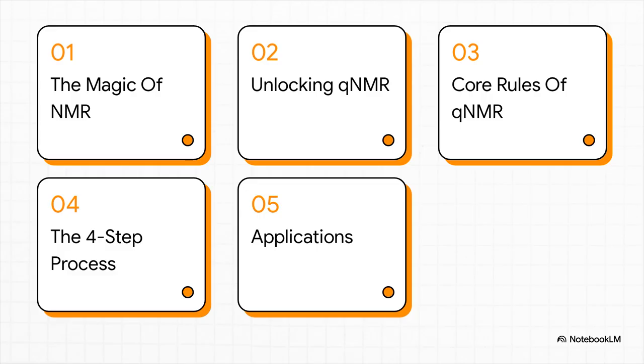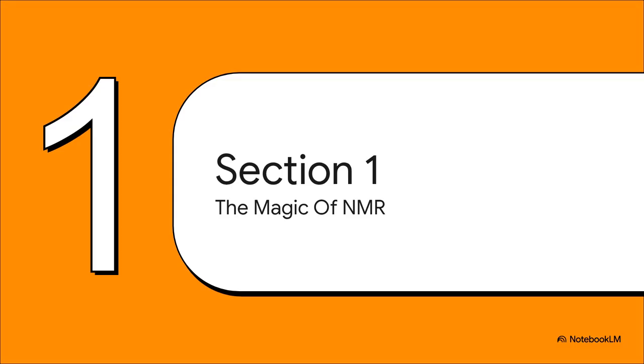Here is our roadmap for today. We'll start with the magic of NMR, then unlock quantitative NMR, cover the core rules of qNMR, walk through the four-step process, and finally wrap up with its applications and advantages. All right, Section 1, the magic of NMR.